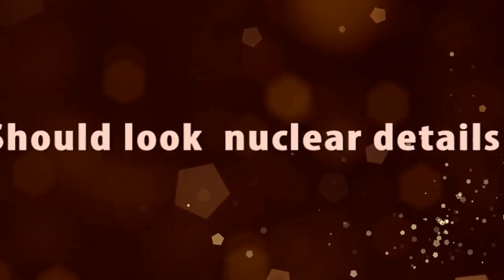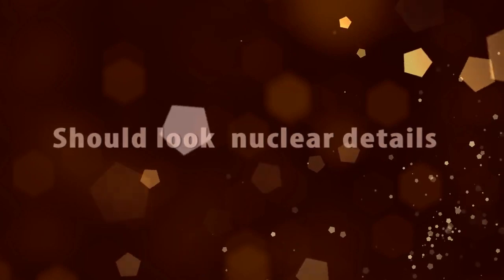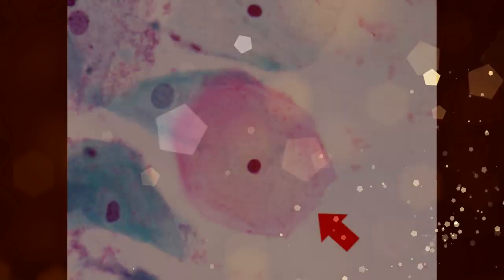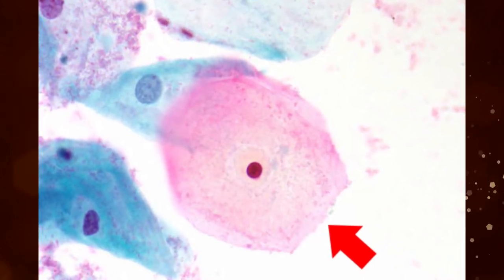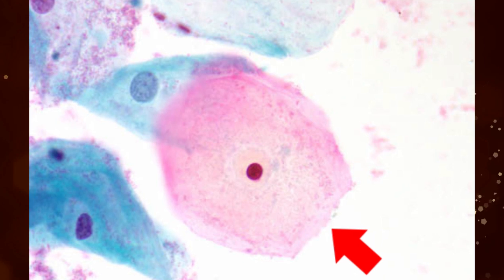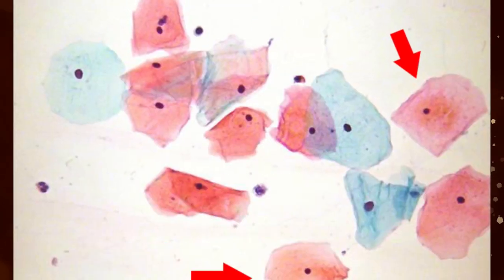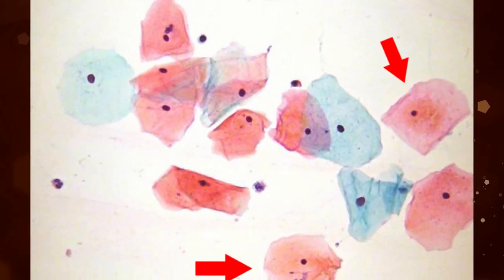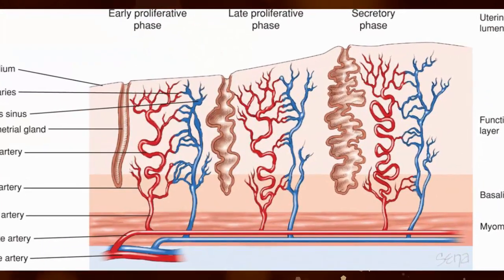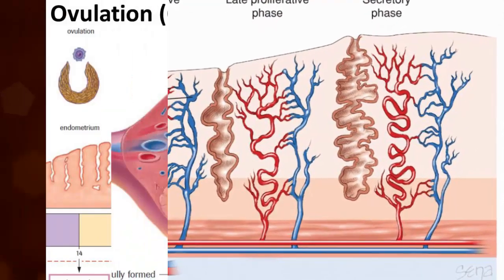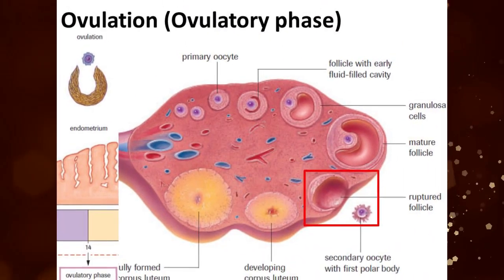We should always look for nuclear details. Superficial squamous cell nuclei are always small, central, and pyknotic. Superficial squamous cells are seen in abundance during the late proliferative and ovulatory phases of the menstrual cycle.